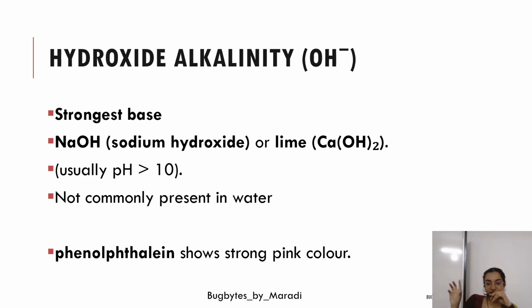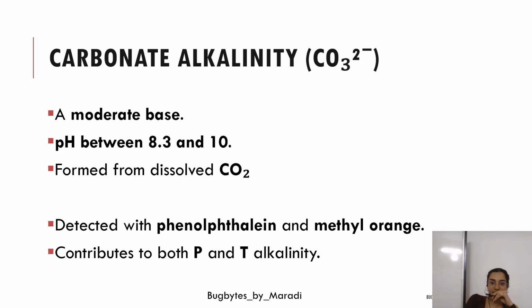I've already told you, in a natural water body or in the drinking water, we don't have hydroxide alkalinity unless and until we add lime. Most of the time, for treatment purposes, we'll be adding lime. So at that time only we'll be having the hydroxide alkalinity. The next one is carbonate alkalinity, CO3 2 minus.